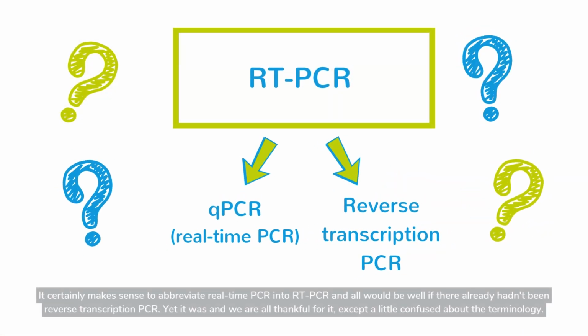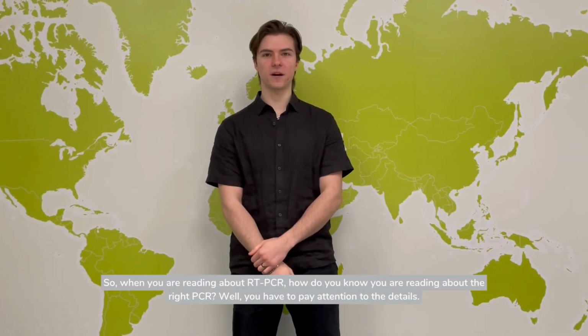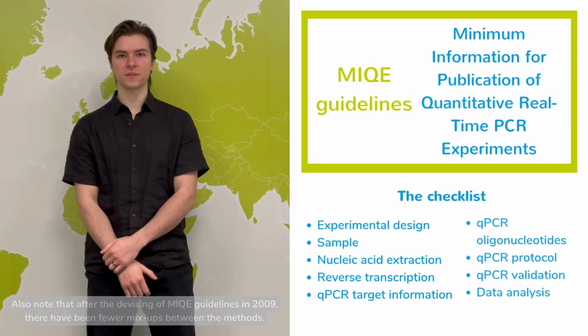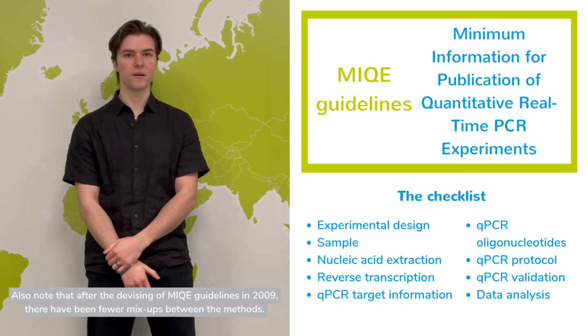It certainly makes sense to abbreviate real-time PCR into RT-PCR, and all would be well if there already hadn't been reverse transcription PCR. Yet it was, and we are all thankful for it, except a little confused about the terminology. So, when you're reading about RT-PCR, how do you know you're reading about the right PCR? Well, you have to pay attention to the details. Also note that after the devising of MIQE guidelines in 2009, there have been fewer mix-ups between the methods.